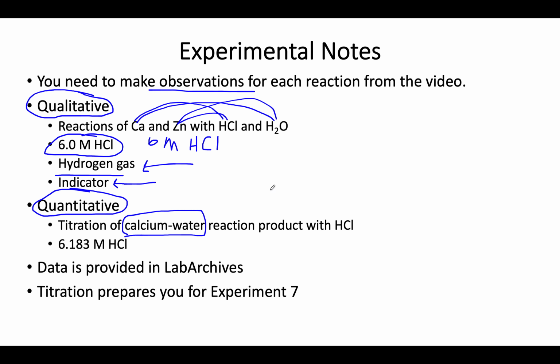So this even says calcium and hydroxide. What we're trying to do is suspend what we know. If you know the formula, calcium and hydroxide, you probably know what goes here as the subscript. But what I'm telling you is suspend that. Don't know what X is. You're calculating X. How this has hurt students in the past is they say, well, I know what X is, X equals this, and they don't do any calculations, and they miss a whole section on the post-lab. So we'll go through the calculations, what you need to do for that.